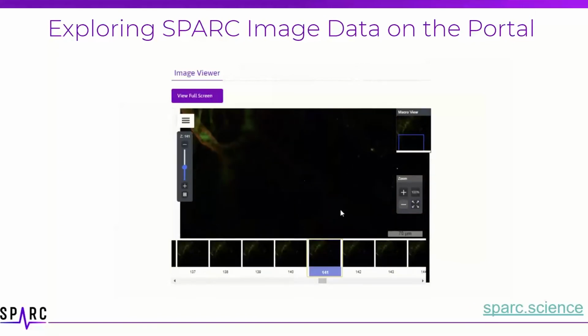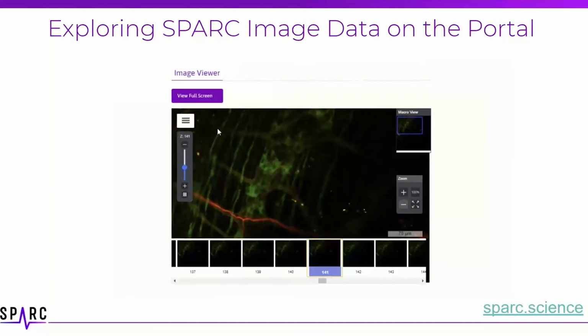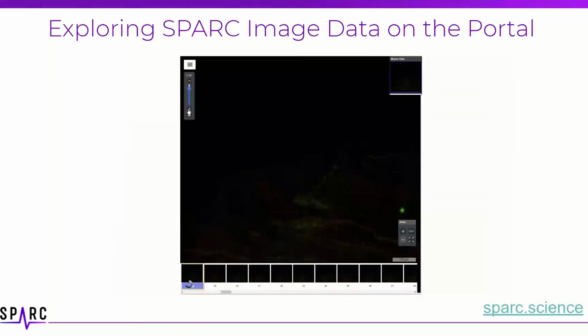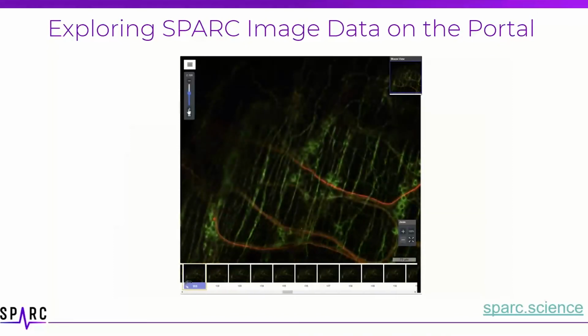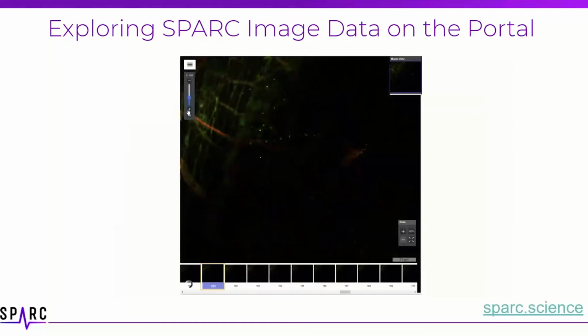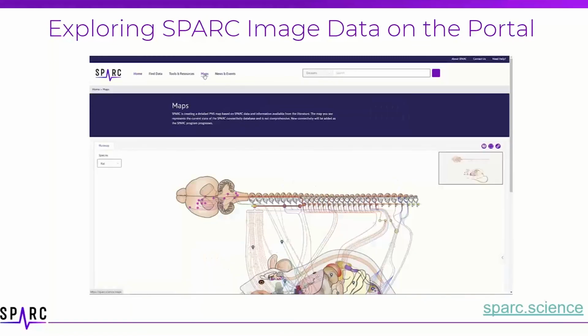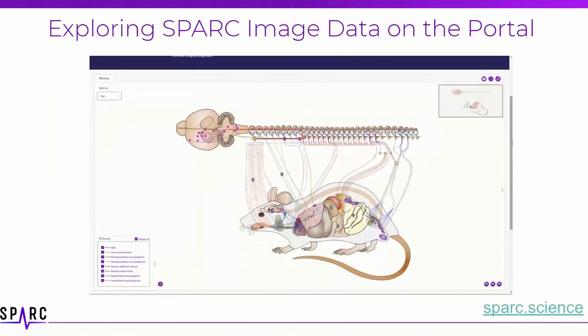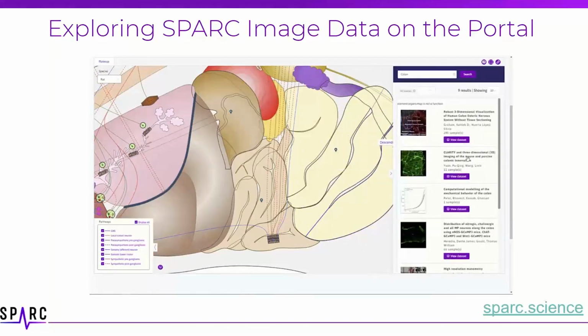Users can explore these images on the web at full resolution just by selecting the thumbnail. And then you can even explore 3D image data plane by plane, like the one you see on the screen right now. In the video here, this data was generated by Dr. Puking Uen from the Dr. Tache lab at UCLA.